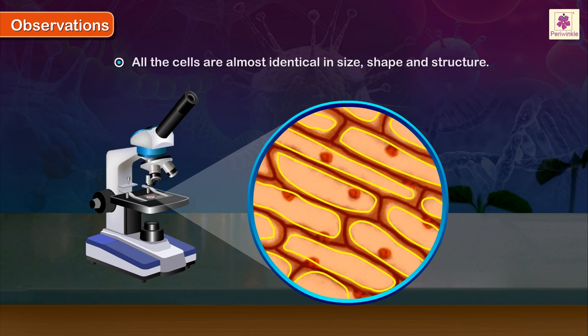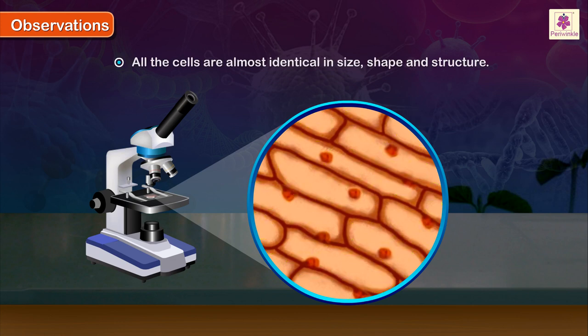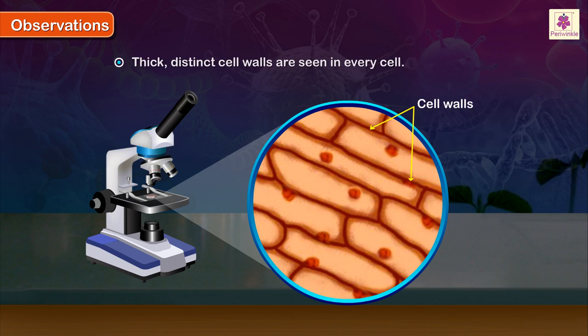All the cells are almost identical in size, shape, and structure. Thick distinct cell walls are seen in every cell.